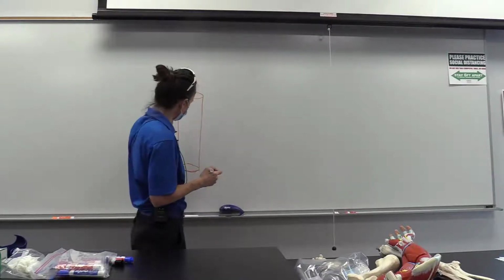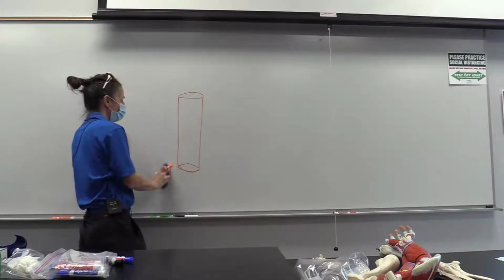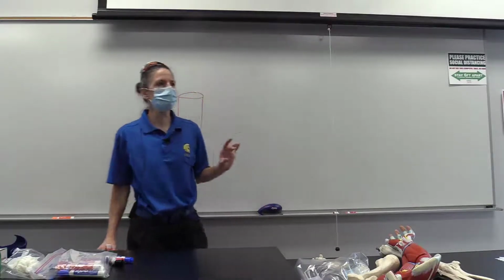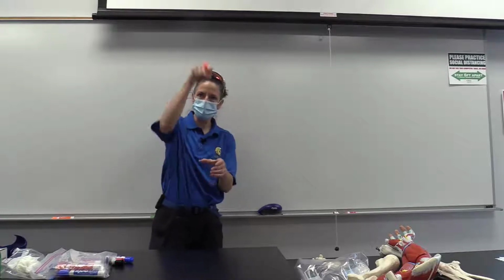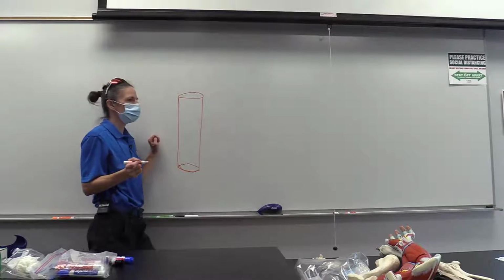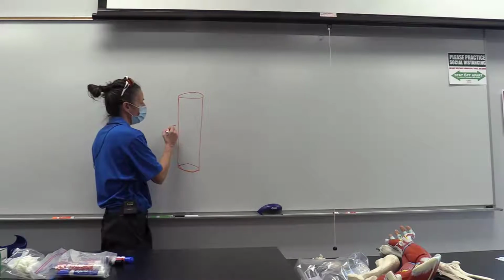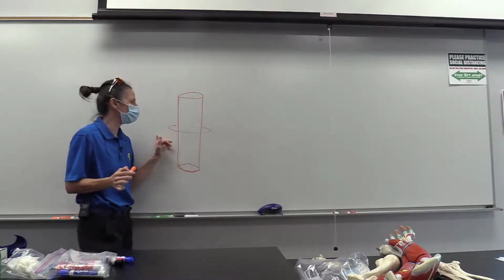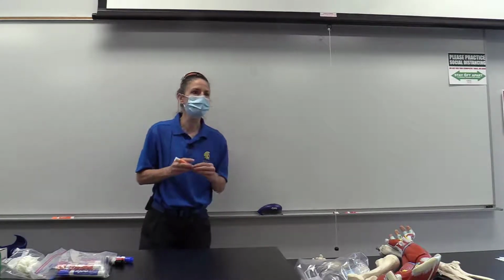And the big thing is that the way they did the experiment, they cut them all the same way. Now, I've actually done this experiment in lab and sometimes the lengths didn't change because it depends on how you bore the potato, right? You can bore it this way, you can bore it lengthwise. We come to find out that if you're paying attention, sometimes they don't grow in length. How else can they grow? In diameter, yes, they can get bigger this way. And so, we learned after a couple of iterations of this experiment that you really got to measure them in both directions to see if they change in one direction or the other.